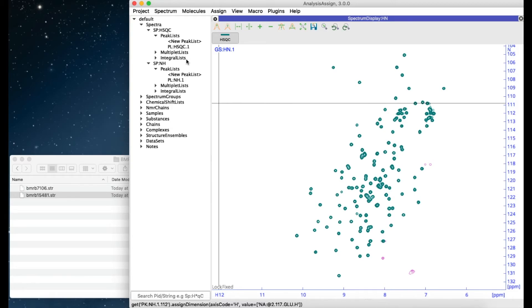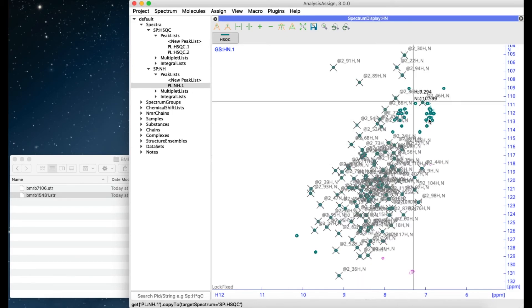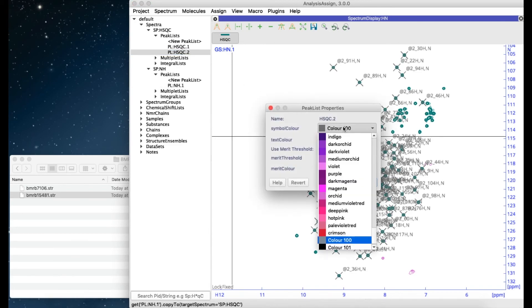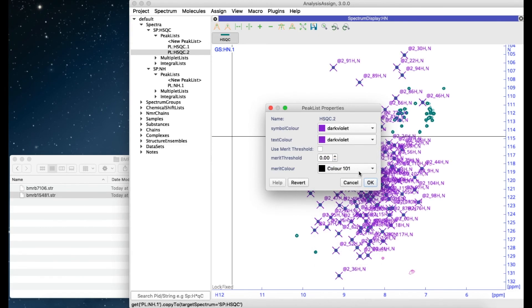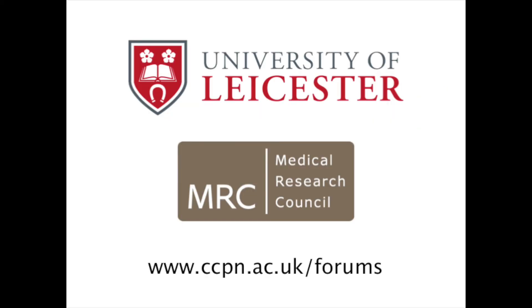You can add this to your HSQC simply by dragging it onto the HSQC. You will now be asked if you want to copy the peak list from the NH spectrum, peak list 1, to your HSQC spectrum. Click OK and the new peaks will be placed — you can see that we've got a second peak list for our HSQC. If you want to make it different from the previous peak list, you can do so by double-clicking on it and changing the colours, for instance. In future, a separate way to create peak lists from chemical shift lists will be added.